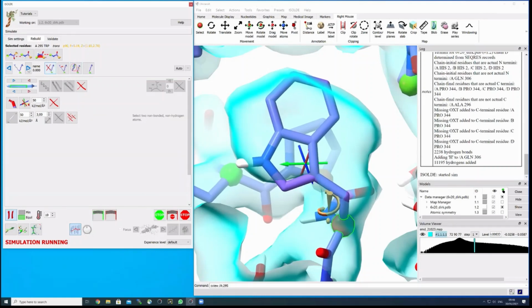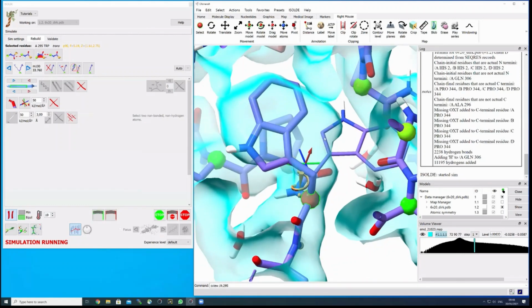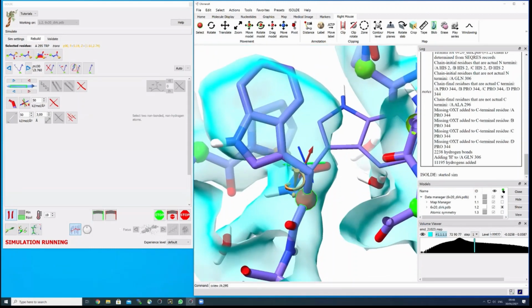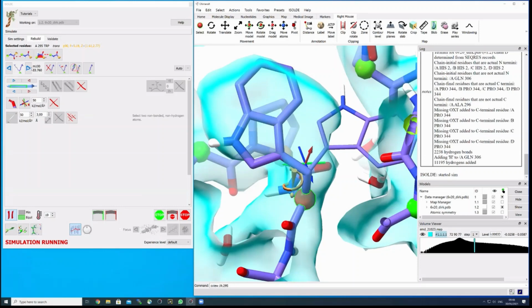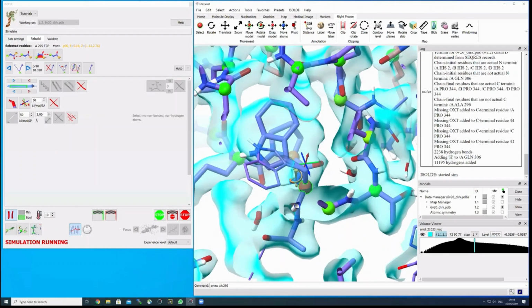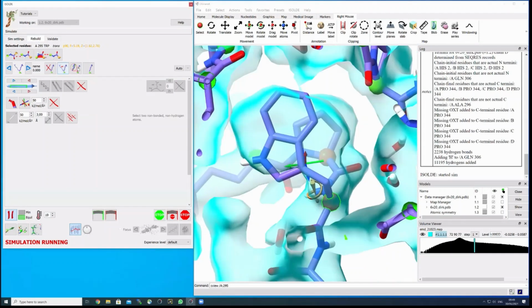If you click on these arrows, you will see that the software will cycle through different rotamer options. The current one is represented in thick, and the one that it suggests is displayed next to it. You can cycle through all the rotamer options until you eventually find one that is satisfying. And you will soon enough see there is none that is satisfying. This is one way of doing it. Here are other ways how to do this.